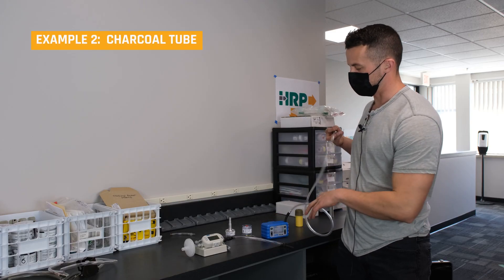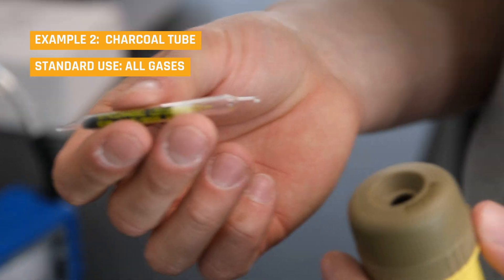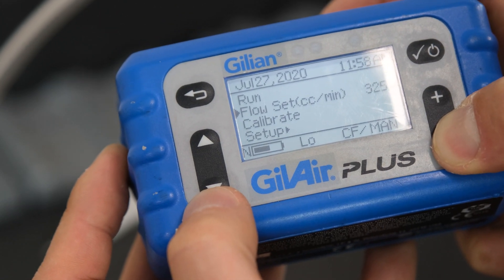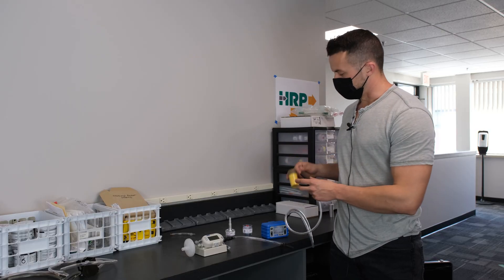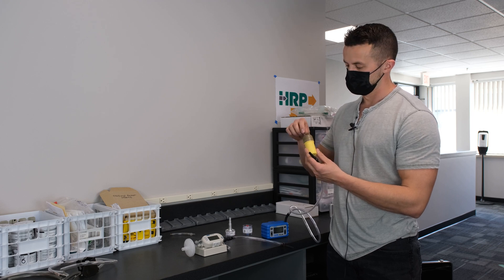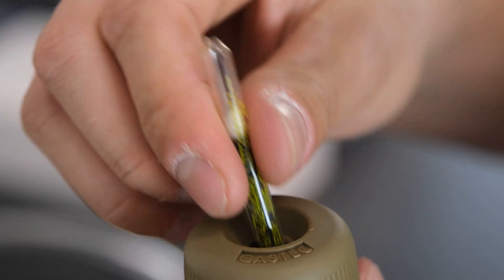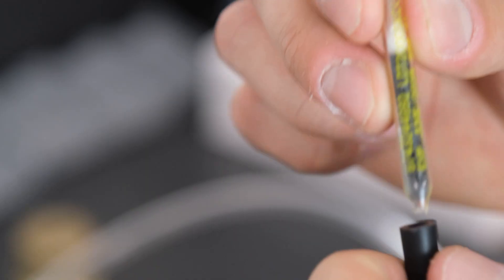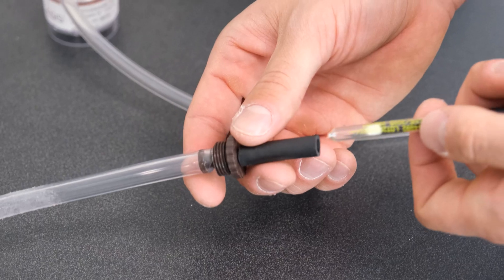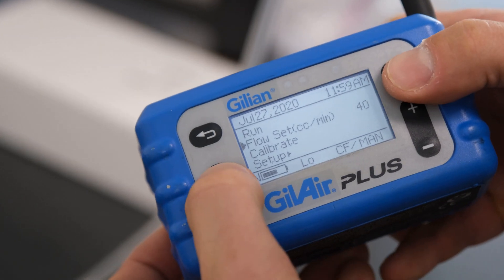Next up we have our charcoal tube sampling. This is good for a lot of gases out there and requires extremely low flow rates. So we're going to set our pump at a low flow rate — we don't need anything high here for our charcoal tube. We need to break the tube open using a glass breaker — don't want to be doing this with your fingers. Then we look to see our arrows, which show us which way the airflow is going — that's the direction of our flow. We insert it to our adapter, and now we need to calibrate it.